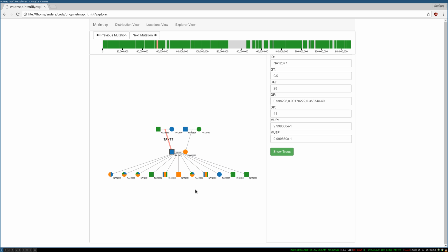Like I said, we've played with this quite a bit, but overall we don't feel like it's an incredibly effective visualization, primarily because it's hard to really explore. If you know what locus you want to look at, you can go to it and see what sorts of information you can get about it and look at the statistics, but it's not really useful as a starting point. We think that this could be adapted to be more useful.